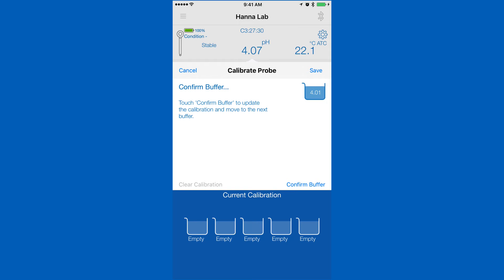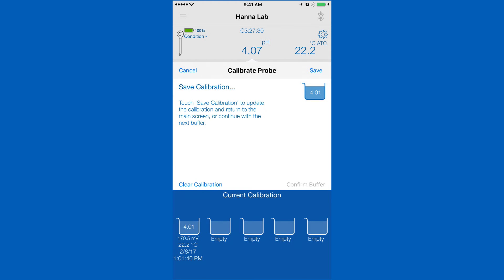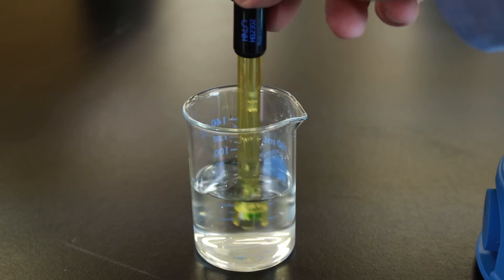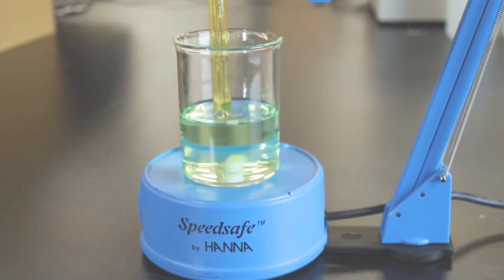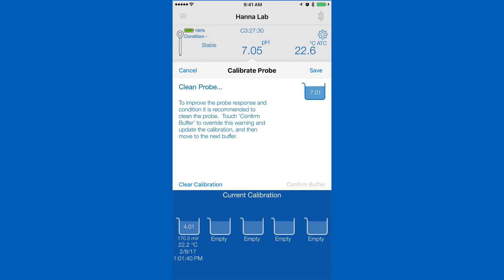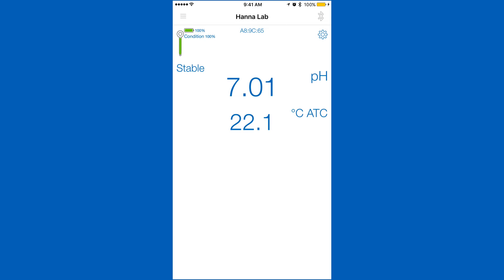Rinse and place your probe in your pH calibration solution and wait for a stable reading. Once stable, tap confirm. To calibrate the next point, we recommend that you rinse your electrode with deionized water to prevent contamination. Place in the next buffer and your saved calibration will be stored, and the app will begin calibrating your next point. After you've calibrated your desired points, hit save to return to the measurement screen.